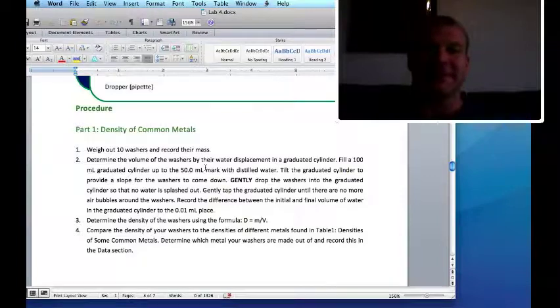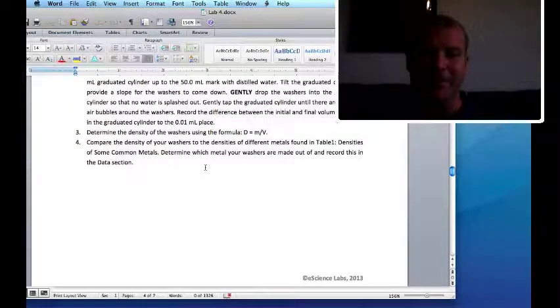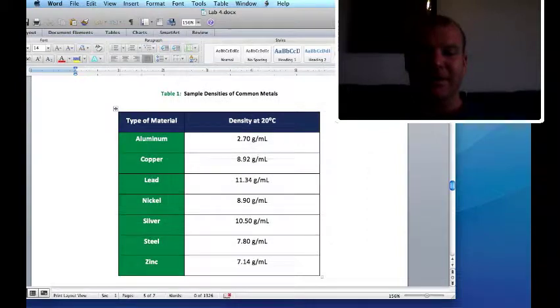The important thing is you have to know how much difference there is in that. So that's what you're going for. You have the mass, you have the volume, you get the density. Then once you have the density, you use this to figure out which one it is. And just make your best guess. You can see here copper and nickel are pretty close. Of course, copper is red and nickel is silver colored like everything else.